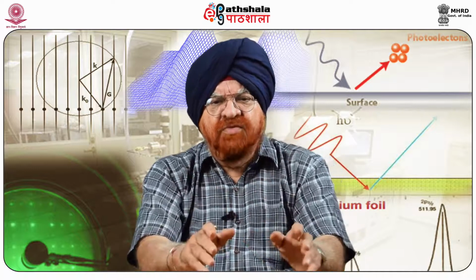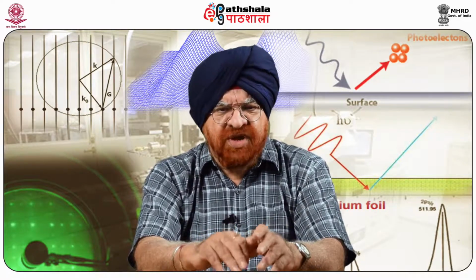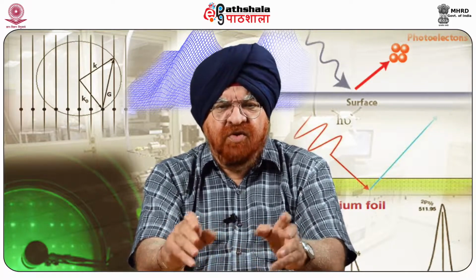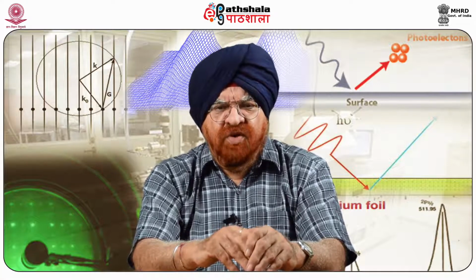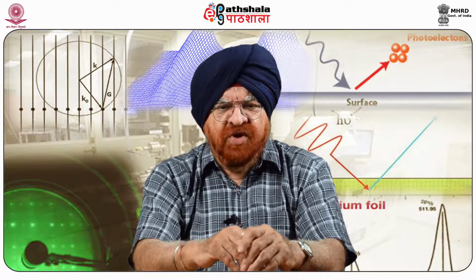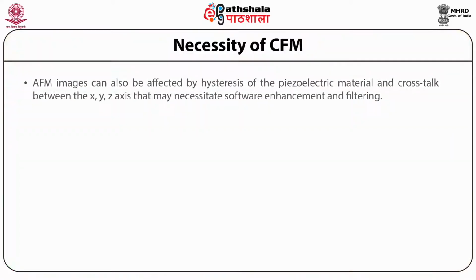Traditionally, an AFM cannot scan images as fast as a scanning electron microscope can, requiring several minutes for a typical scan, while an SEM is capable of scanning in near real time, even though a relatively low quality can be obtained. The relatively slow rate of scanning during AFM imaging often leads to thermal drift in the image, making the AFM less suited for measuring accurate distances between topographical features in the image. AFM images can also be affected by hysteresis of the piezoelectric material and crosstalk between the X, Y, Z axes that may necessitate software enhancement and filtering.